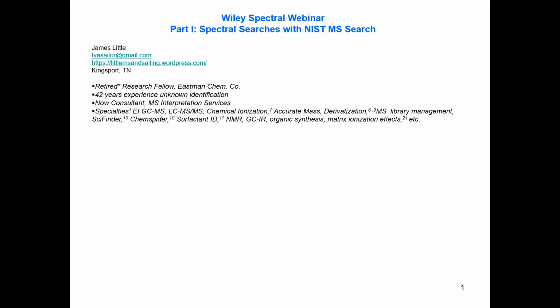I had a lot of specialties, and they were all somewhat related to identifying components in mixtures or doing reverse engineering of products, etc. And they're on my webpage. If you want to look at them, you might find them useful for some other applications, but in general, they supported my identification by GC mass spec.